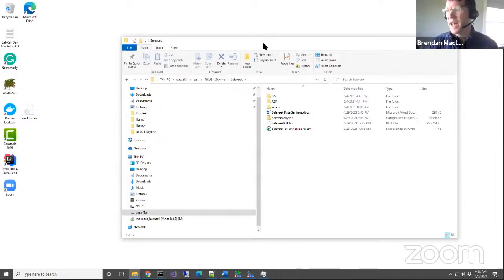If your lock mass calibration is shifting by 10 ppm, you're going to get some scans that are shifted by 10 ppm and some that are not. So you'll have this weird bimodal distribution. Our lab is definitely turn off the lock mass calibration.